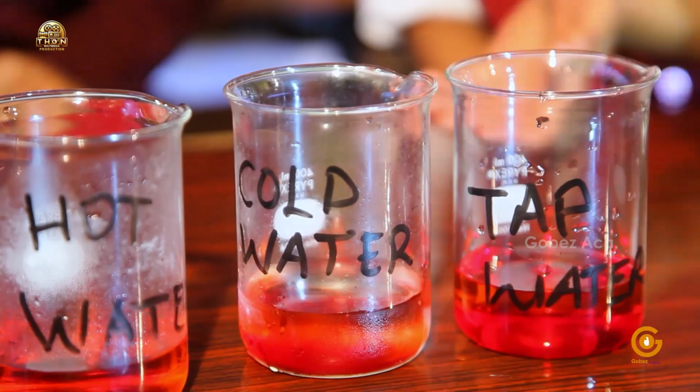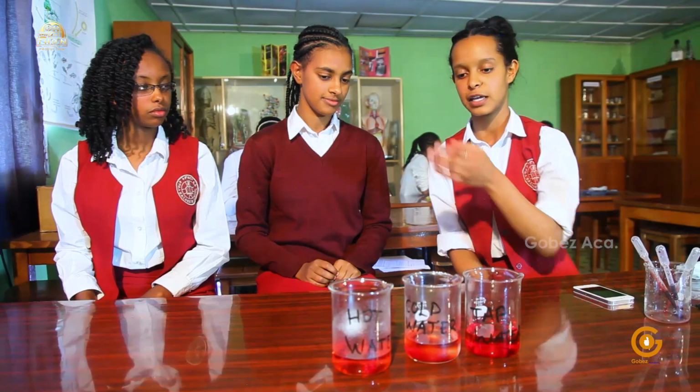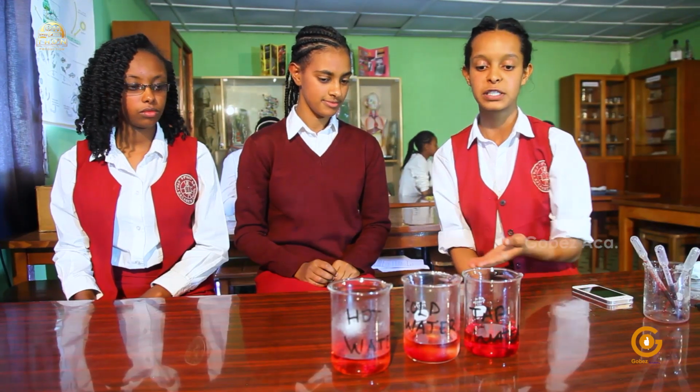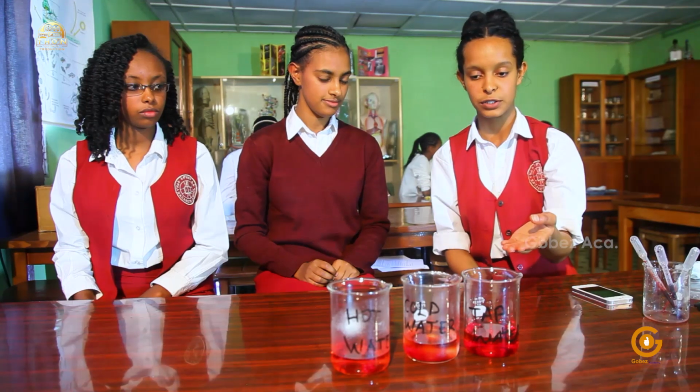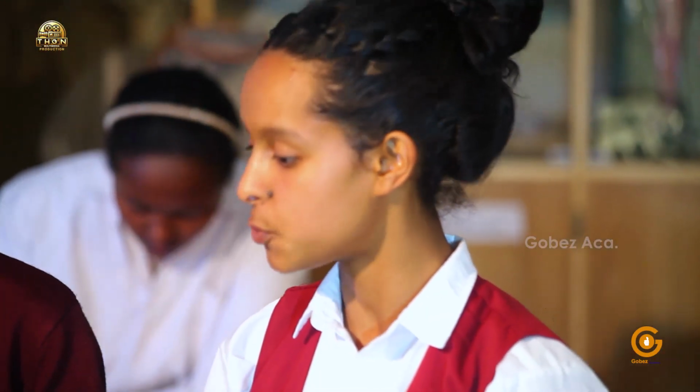In terms of the color, we observe that the color is the most visible in the case of the hot water, moderately visible in the case of the tap water, and the least visible in the case of the cold water. Our observation tells us that the colored molecules diffuse at different rates.